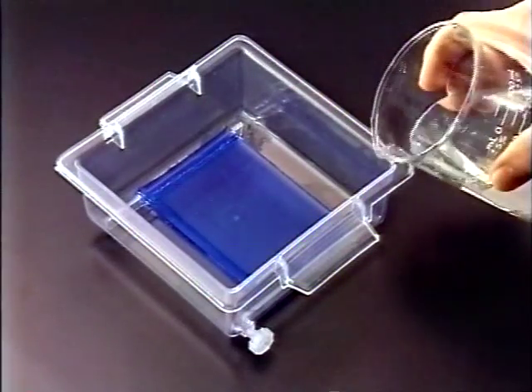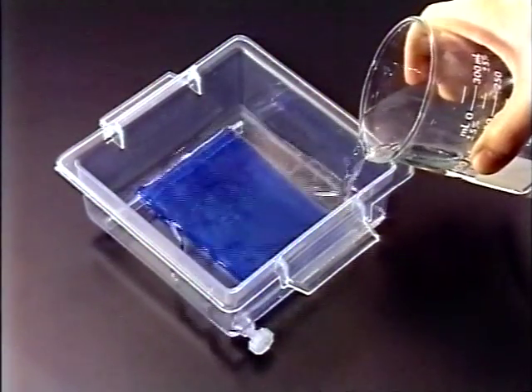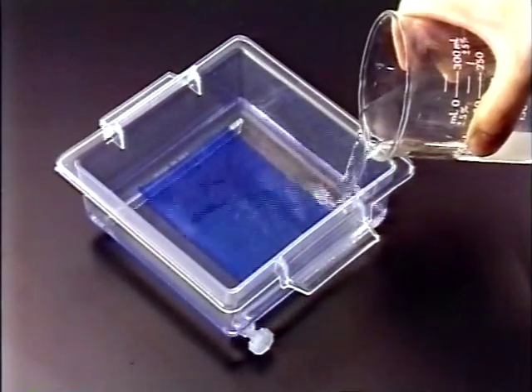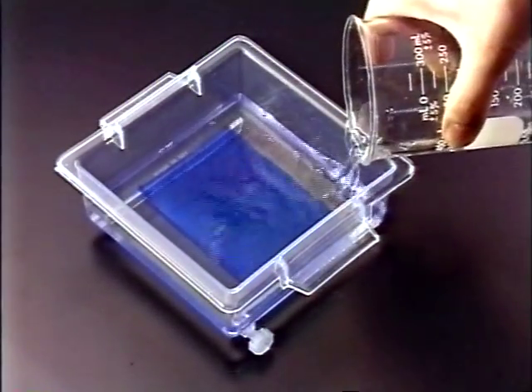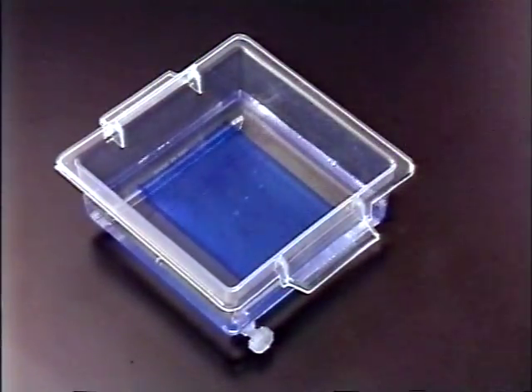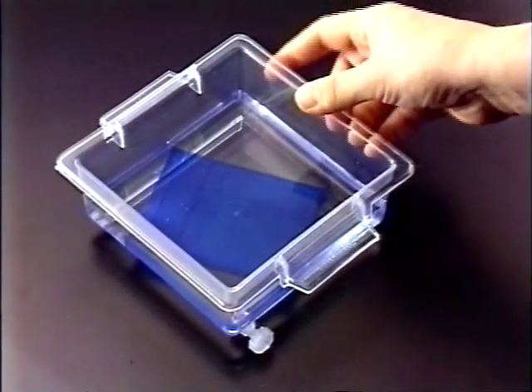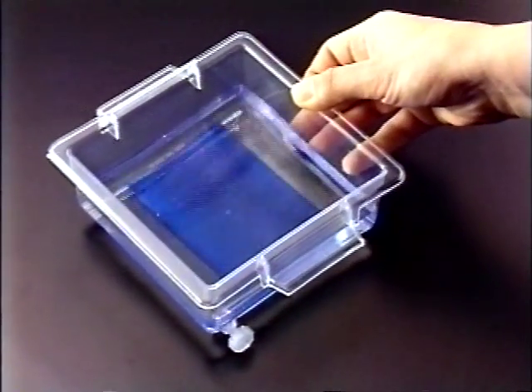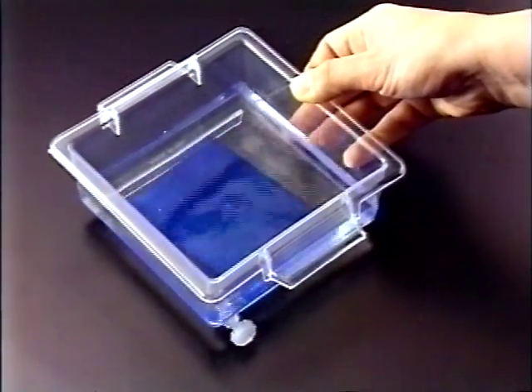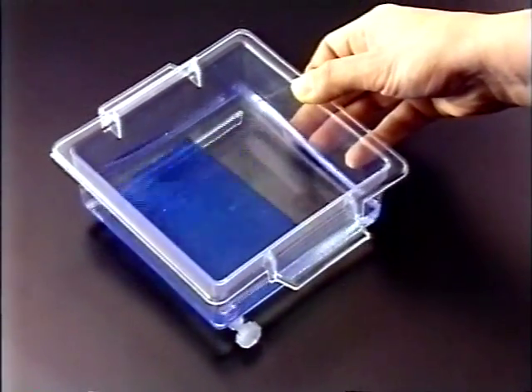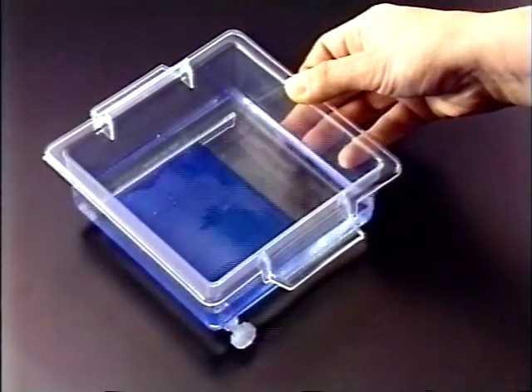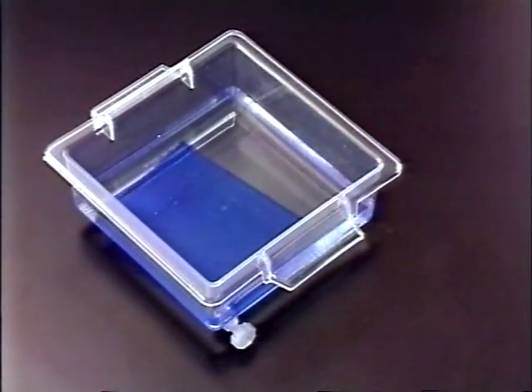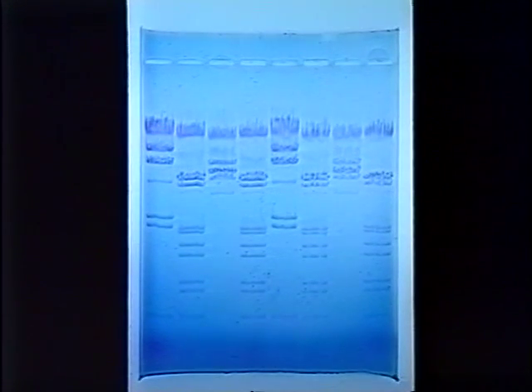Add distilled water to destain the gel. Gently rock the tray and change the water several times to remove the background color from the gel, leaving dark blue DNA bands. View the gel against a light background, such as white paper or on a light table. Gels may be stored in a sealed plastic bag.